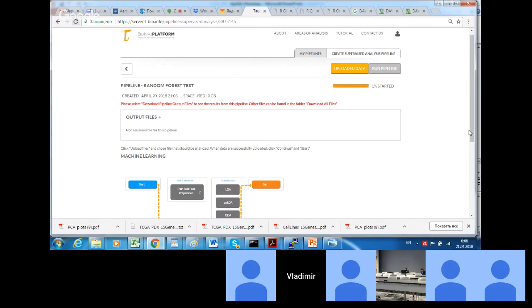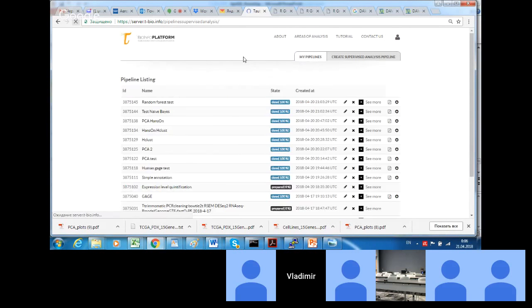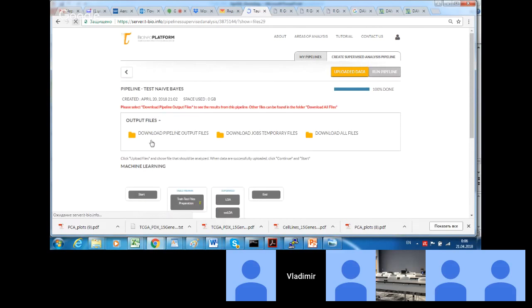Today, we discussed only one approach to clustering, however, multiple approaches exist. And then, if we know groups, if we know which groups are associated with the question of interest, for example with the pathology, and if we have a learning set of examples for each subgroup, we can construct classifiers using supervised machine learning analysis approaches and attribute new samples to one group or another.